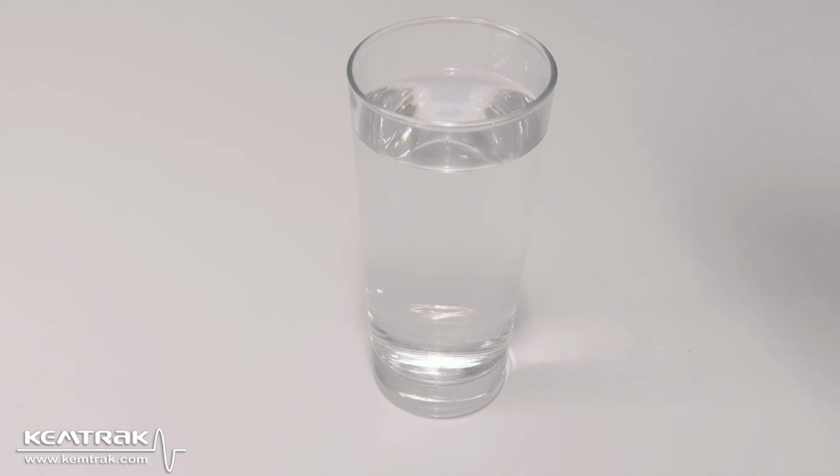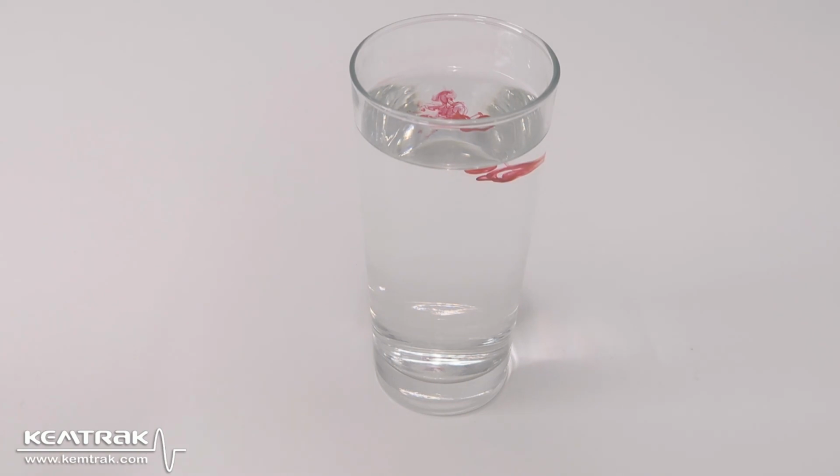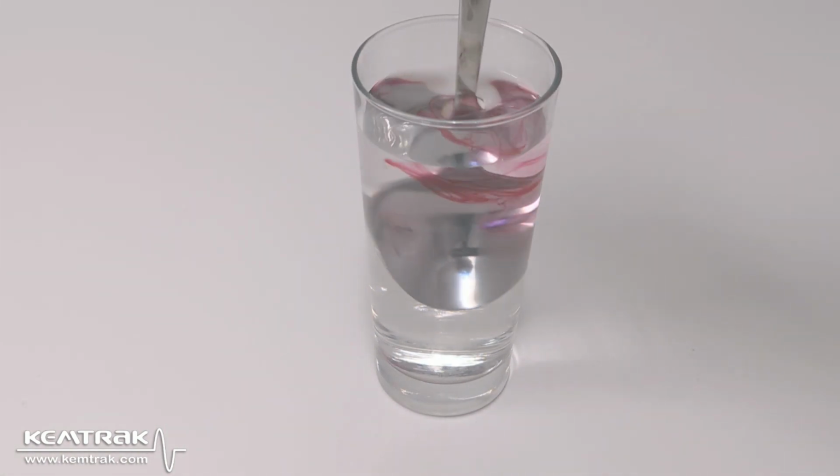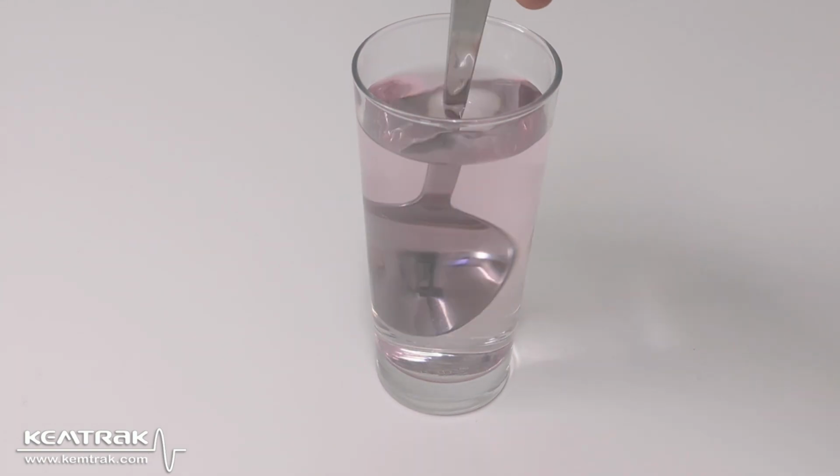If I add 1 drop of red dye into the glass containing water, I clearly see that the color is changing to red. Photometers can measure the intensity of this red light specifically.